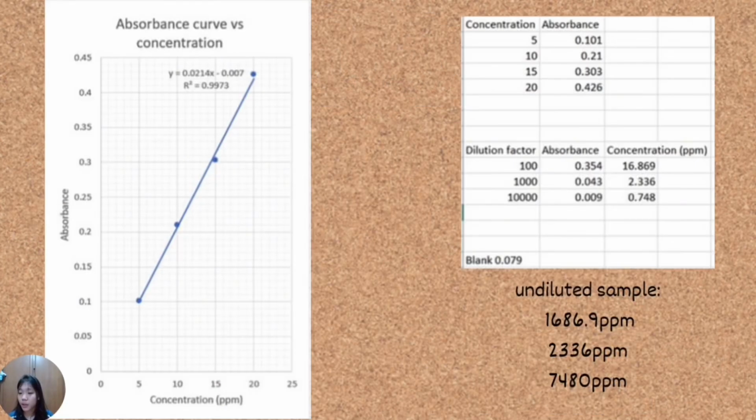Once the experiment concluded, we utilized the standard mean absorbance and the concentration of the calcium standard solution to plot the graph. This graph provided us with a reference to determine the concentration of calcium in the sample, which is Fulcrum milk, using the sample mean absorbance. After determining the concentration of calcium in the sample, we then scaled back the dilution factors of 100, 1000, and 10,000 folds. This process enables us to obtain the exact concentration of calcium in the Fulcrum milk sample, taking into account the dilution factors applied during the experiment.